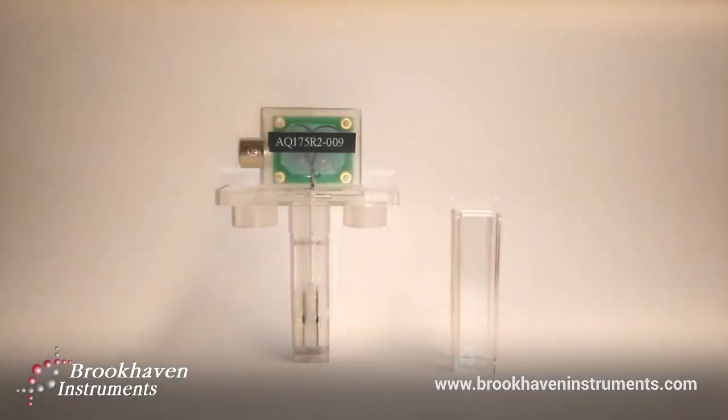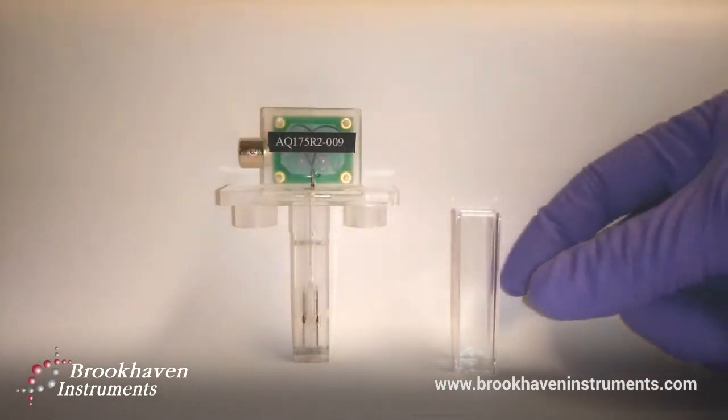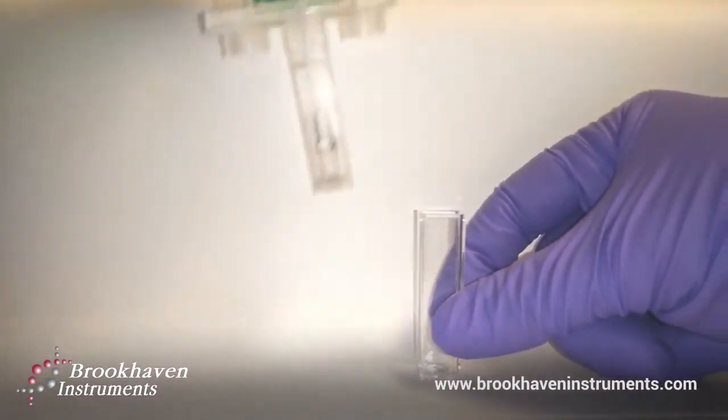To prepare for measurement, just take a disposable square cuvette and insert the electrode until snug.